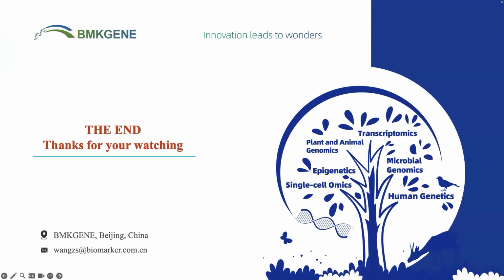Thanks to Johnson. He explained the topic in great detail. I believe we have a good understanding of visualizing key pathways and WGCNA analysis with real data. Now we have received some questions about this. The first question is, for the Venn diagram, can any part of the diagram be selected or just the intersect part? Let's ask Johnson to answer for us.